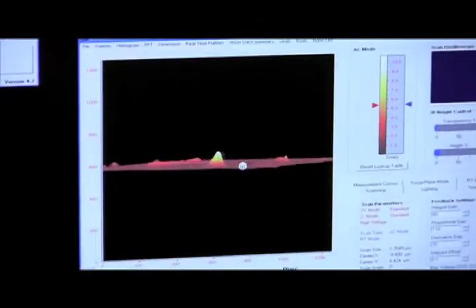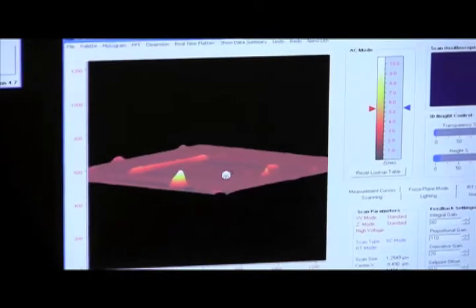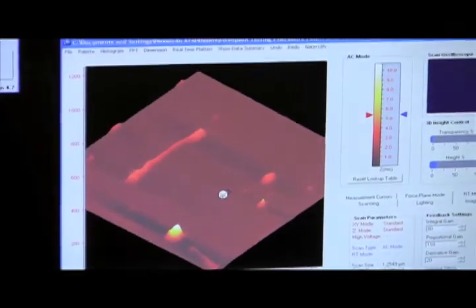It took us several hours actually. It was a little tedious, but it was just sort of fun, something I just wanted to do. I can make it any color I want, so you might as well make it red and gold for Simpson, right? So it's the smallest image of the SC that you will find ever in the whole world.